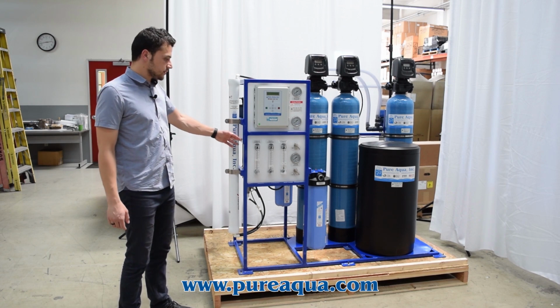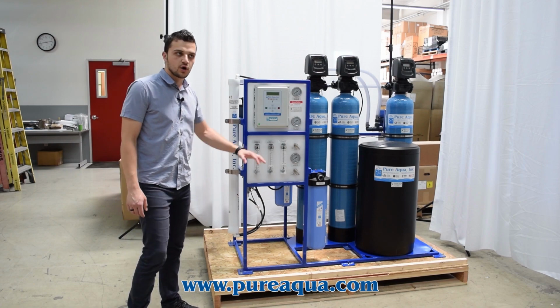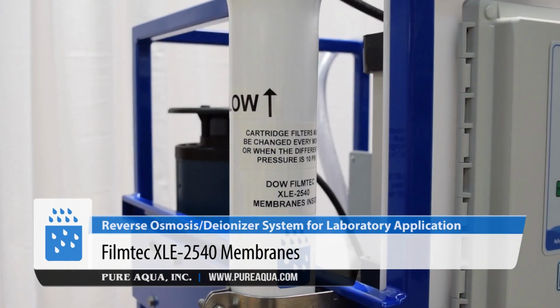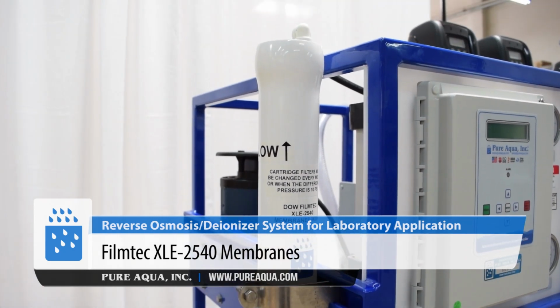So the product water gets further treated here and passes through a deionizing cartridge, where whatever dissolved solids do not get removed by the membrane are removed by the DI cartridge to get the customer very close to ultra pure water, because again, this is for a laboratory application.